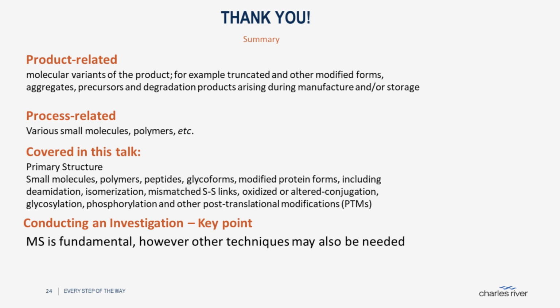The ELISA reagents themselves, significant effort needs to be put into developing those reagents. So kit-based methods, again, generic type methods are okay to use for, say, phase 1 and 2 type programs, but because they don't offer that specificity towards your particular expression system, those product-specific ELISAs need to be developed using inoculations of animals independently, and that process can take 6 months to 12 months. So that's one of the major differences there, is that the process to just develop the ELISA can be fairly long, but once it's in your hand, it's fairly quick and easy to use.